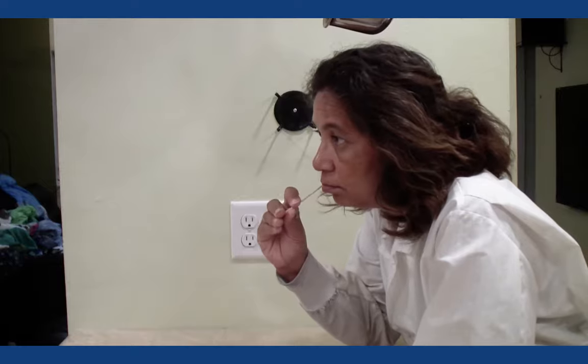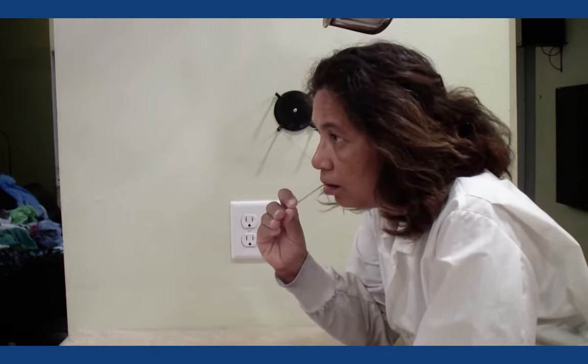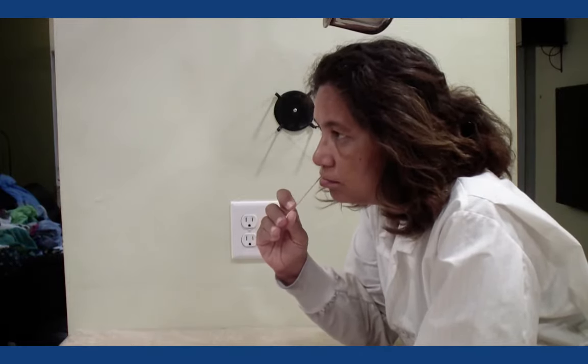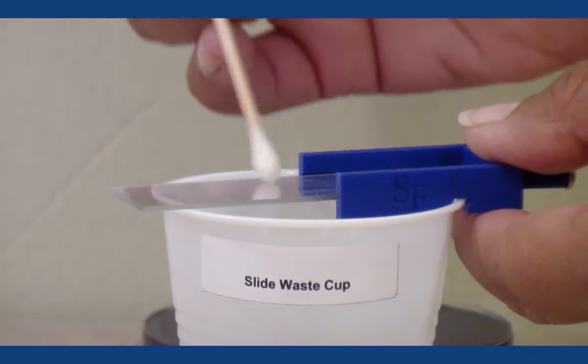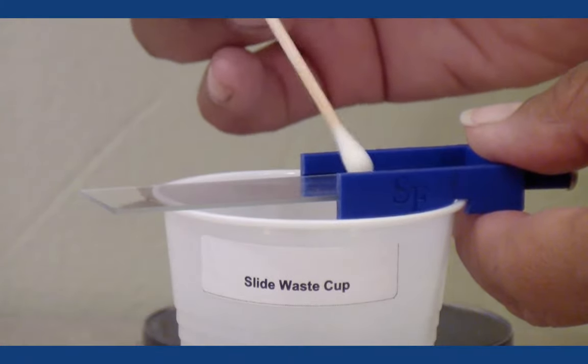You will use the same cotton swab to take a sample from your cheek and to spread on MSAT. Put the cotton swab in your mouth and rub the inside of your cheek, picking up some saliva in the process. Rub the cotton swab over the center of the glass slide.